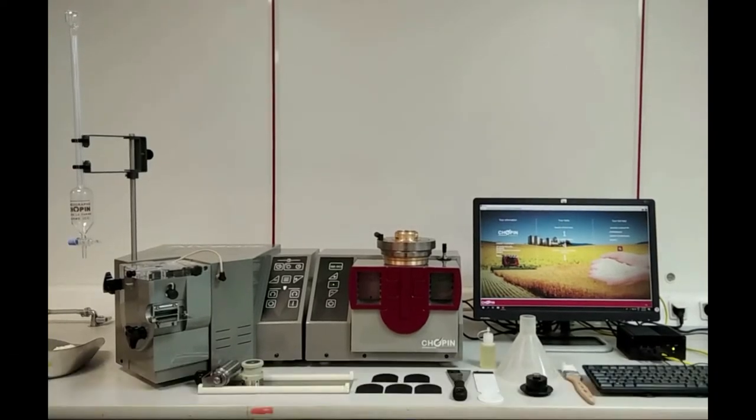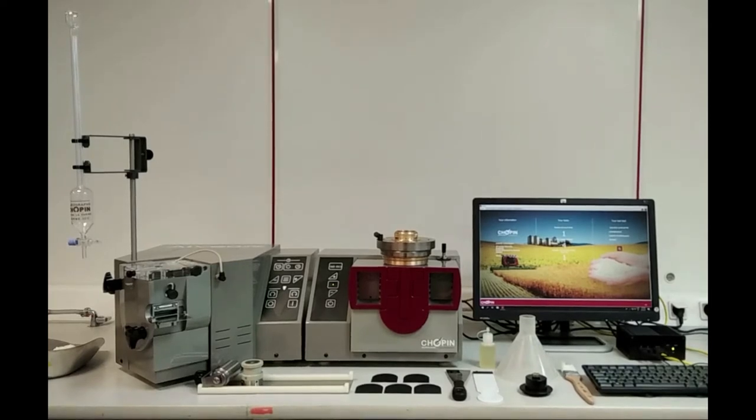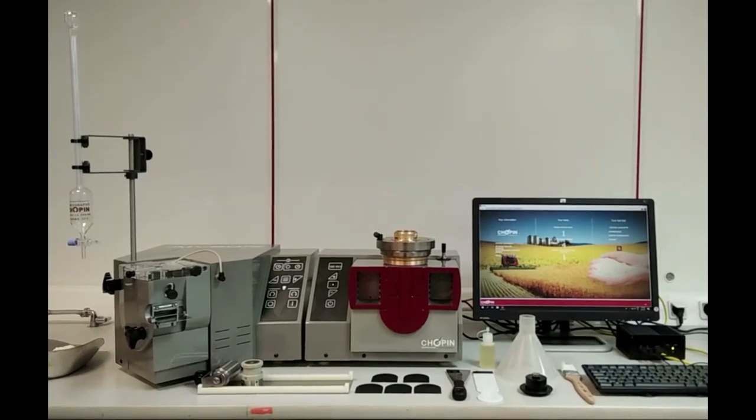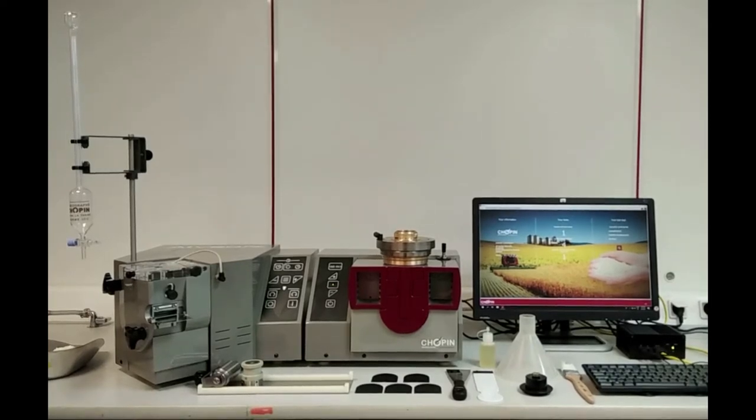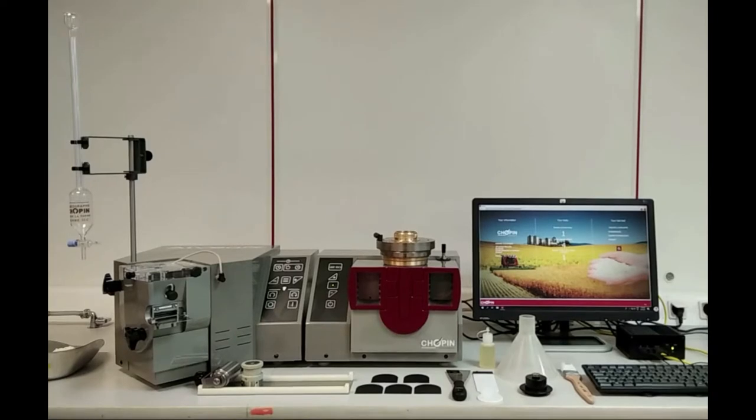Today we will see how to run a test using an Alveo PC, an instrument from Chopin brand for measuring the rheological characteristics of a bubble of dough during deformation.